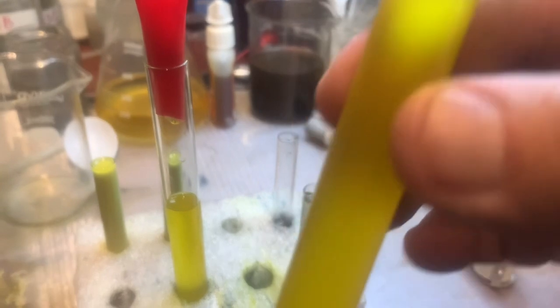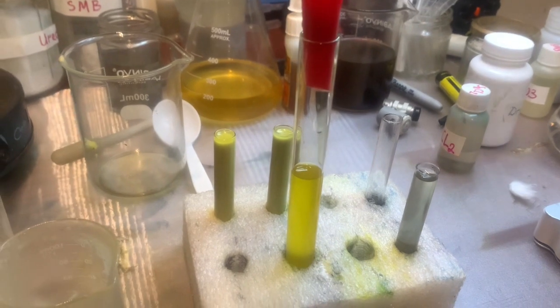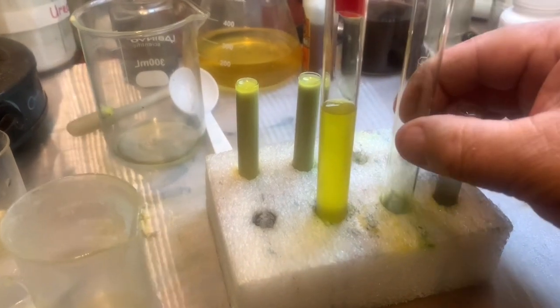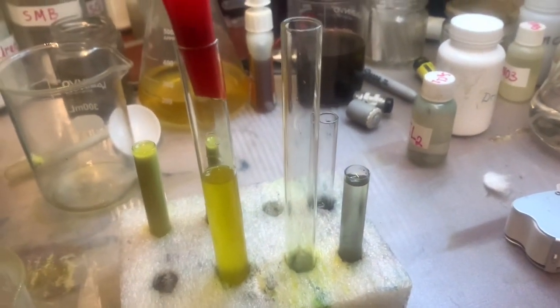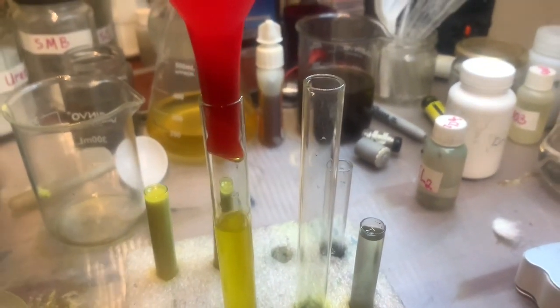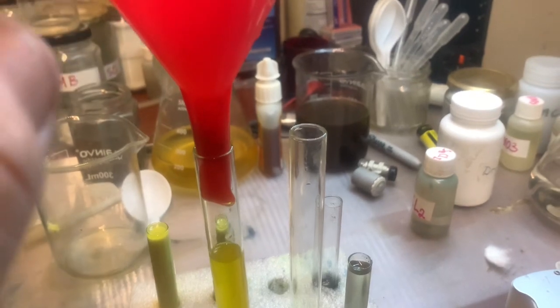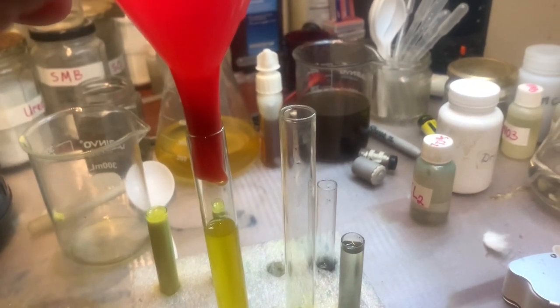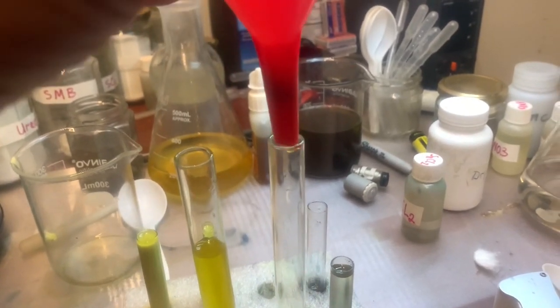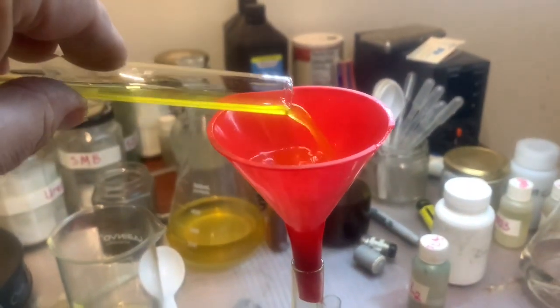this is not so clean, it's still, you see, murky, transferring back to this, and I try to filtrate one more time. Okay, let it go almost to the top. It's going fast. And what happens is that the silver in that solution clogs the filter, and then it slowly gets cleaner. Now, after this, I can already do precipitation. Okay, transfer here, and putting all this in one more time to filtrate.